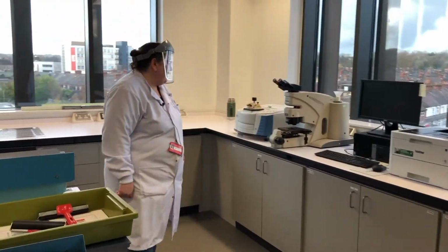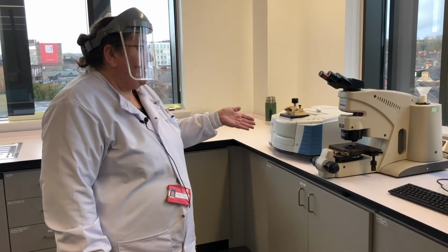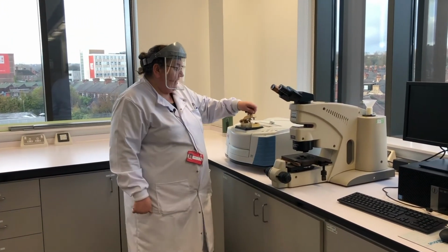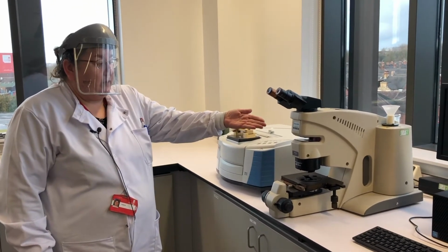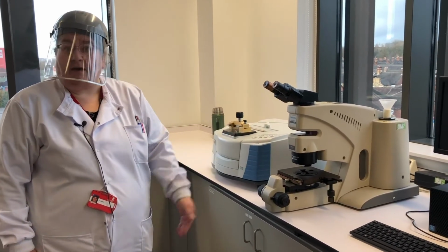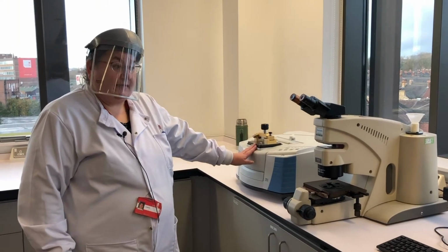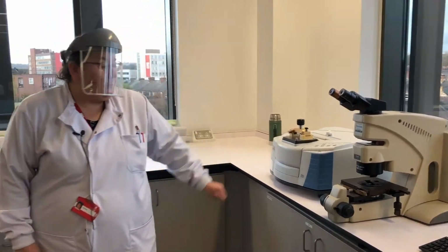We've got our FTIR, our Fourier transform infrared spectrometer, and at the moment this is being used an awful lot by the project students and the practical students when they're looking at drugs and paint samples. They put them under the Golden Gate, they clamp it through the diamond, and then this is identified on the screen. At the moment, our microplastics research group is also using it alongside the microscope to identify unknown microplastics that they've found in the Hudson River. Again, a good piece of kit used in conjunction with the Raman and the VSC, and this also links in with the analytical lab where the drugs and the paints are also used. So another good piece of kit.